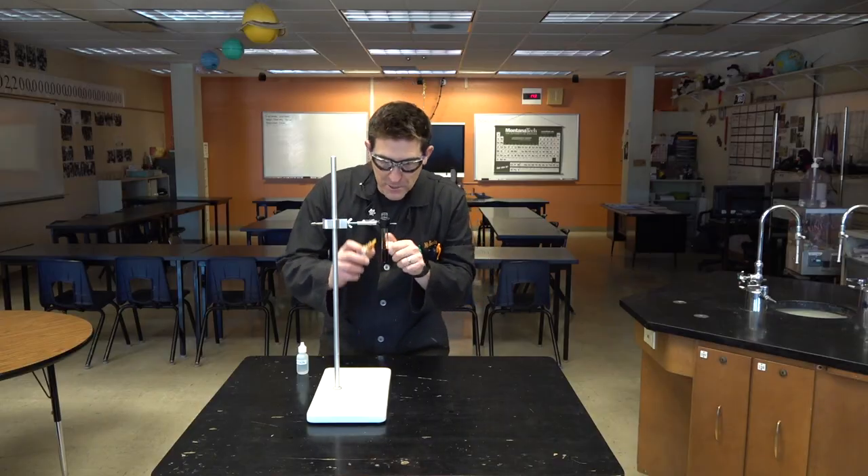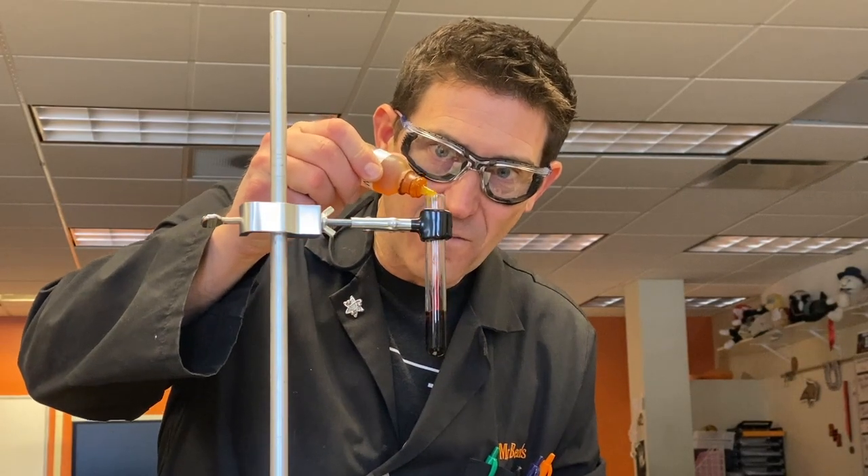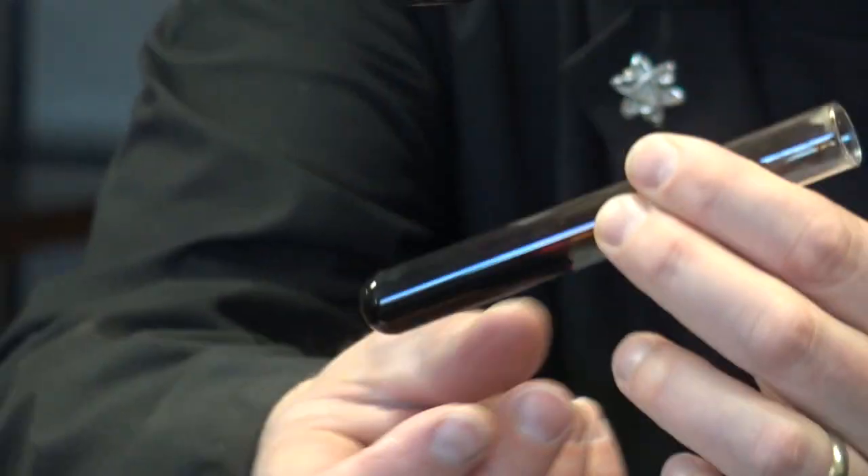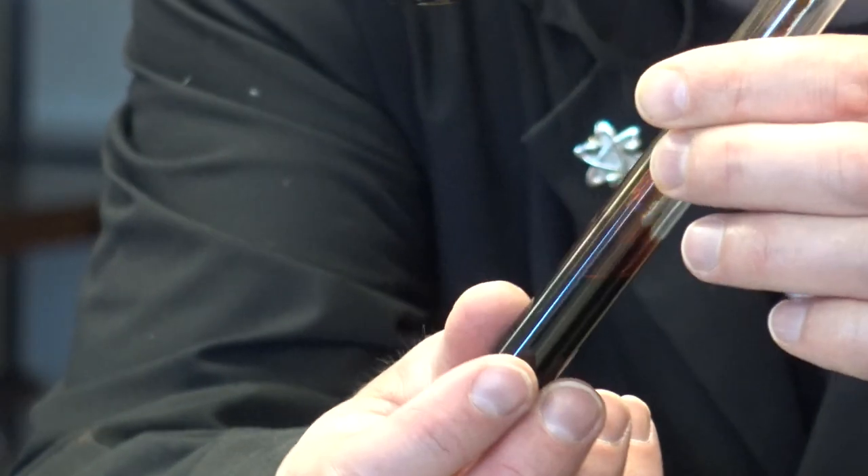I'm going to do a couple more drops to concentrate it. One, two, three, four. There we go. That's pretty good consistency of blood.